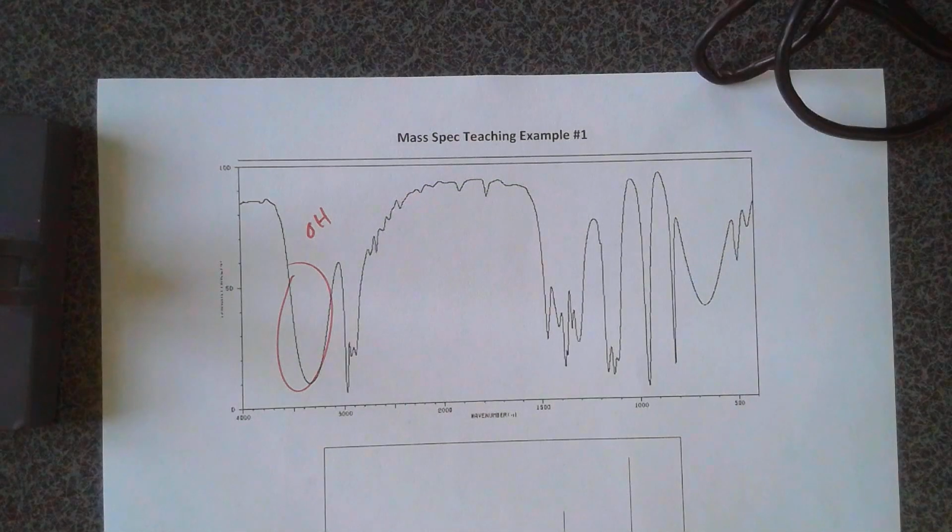So an achieved level student is just identifying things on there. Merit level students are tying it all together, seeing all the different components to be able to figure out what functional group it is. An excellence level student is able to show me some process of elimination.